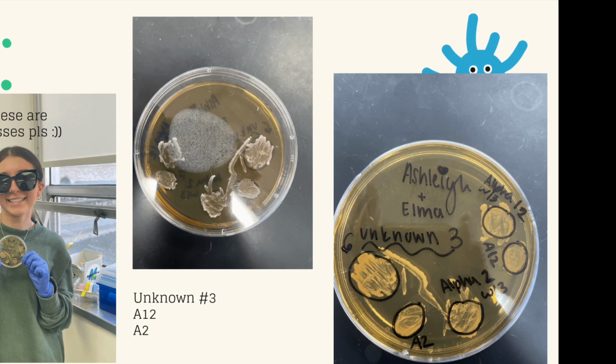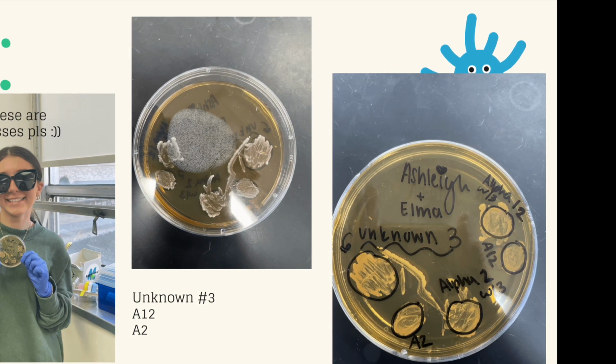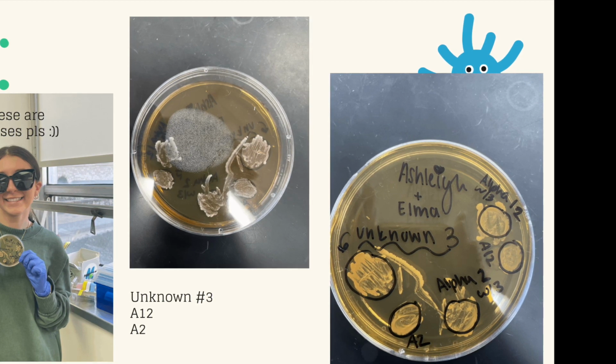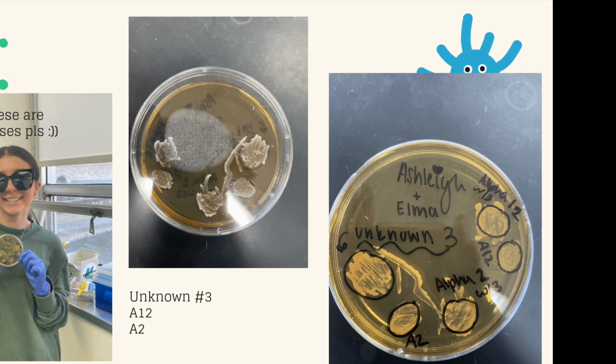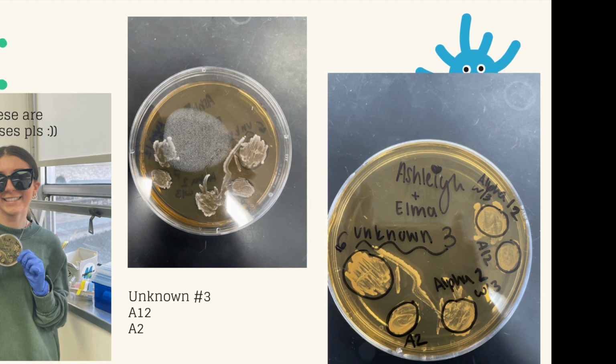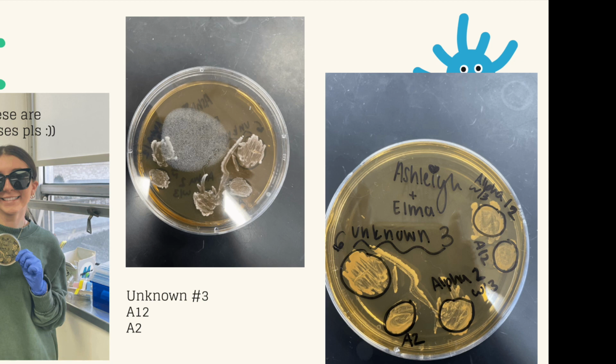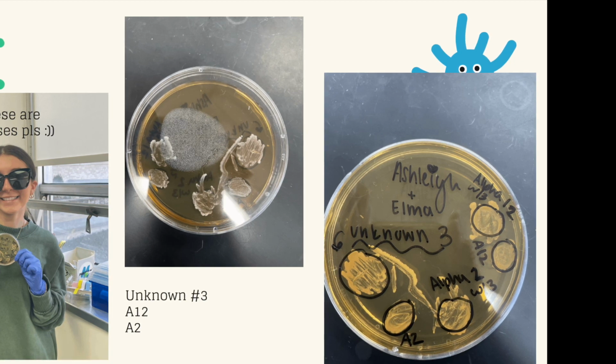It's hard to tell, but there is some peach, light red coloring. You can see it a little bit better in the middle picture, although it almost kind of looks yellow with the agar color, but if you looked closer in the natural light, you can see it a lot better to tell it does have some color.